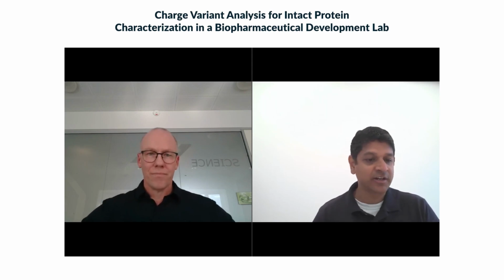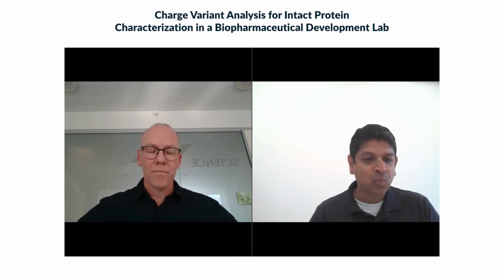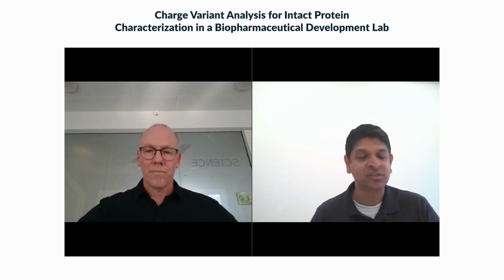So let's get started. The first question is, can you elaborate on when and why you chose between the different charge variant analysis methods for your MS, such as CIEX-MS or ZipChip MS?